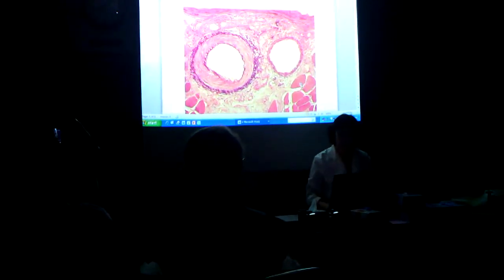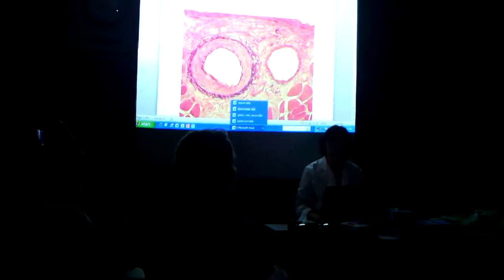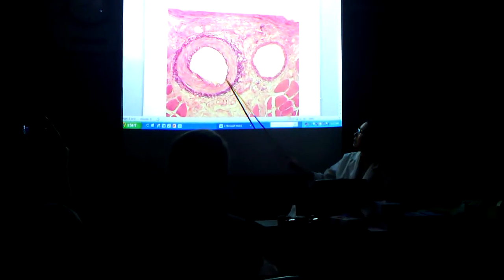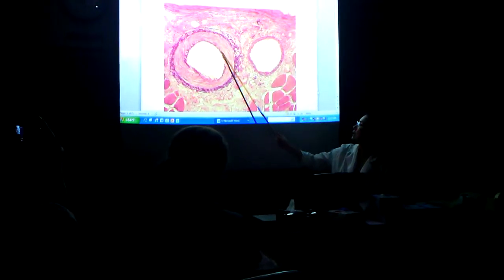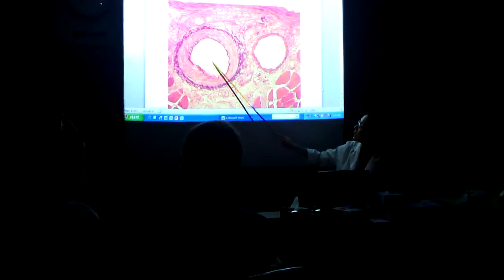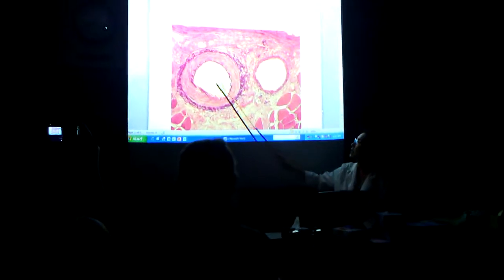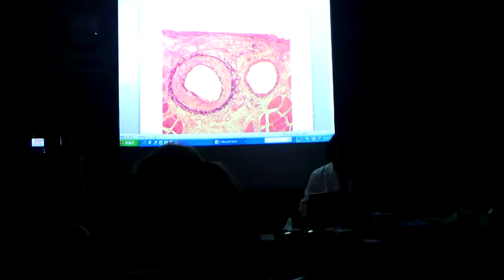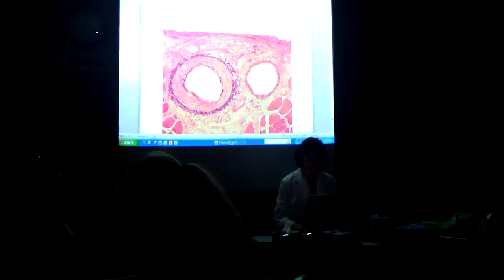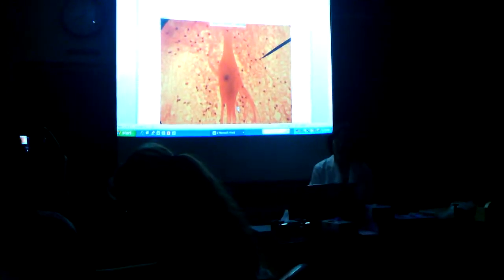Okay. Is that the tunica externa? The tunica interna, is that the open? The interna right here. Which part? The yellow part? The yellow part right here? Yeah. That's a lumen. Lumen, L-U-M-E-N. Yeah, that's the opening in which the blood's going to flow through.